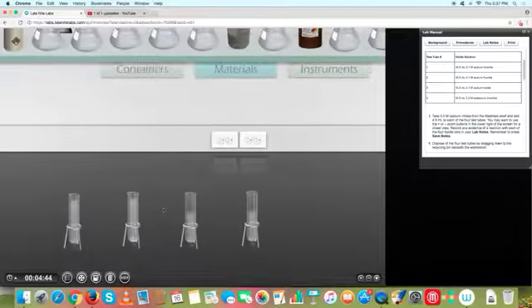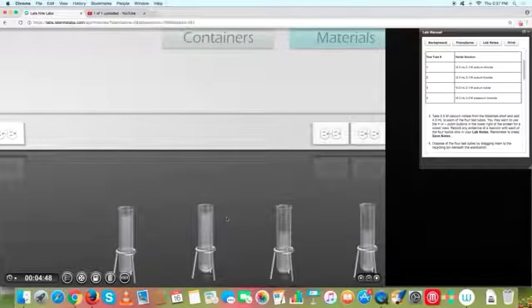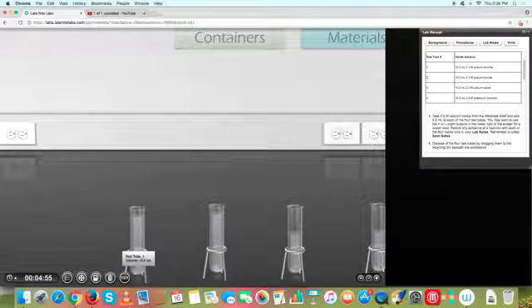Then I look at the bottom of this test tube, and if you look closely, you'll see there is a bit of solid in here. You can see the difference between that and the previous one. There's nothing in the bottom there, but here you've got a bit of solid. That's considered a reaction. That's what you'll be looking for.